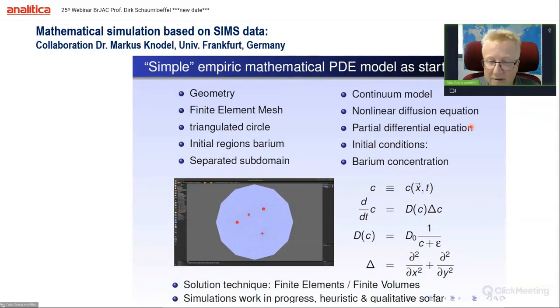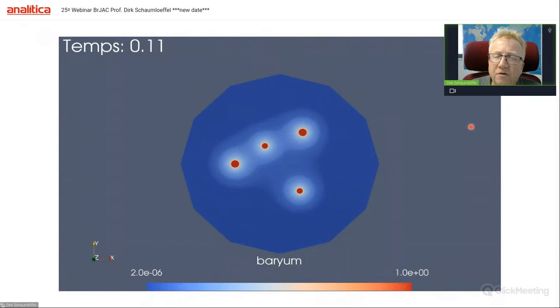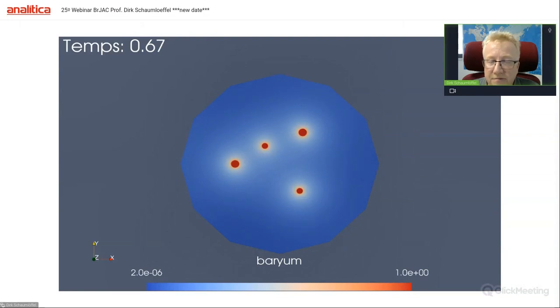As an example, the first calculation to make a static image dynamic, he was calculating the dissolution of 4 nanoparticles inside of a cell. So this is a model. He created a small video and showed with these equations how these particles are dissolving over time, and the barium is distributed all over the cell. So this can be done by mathematical simulations.